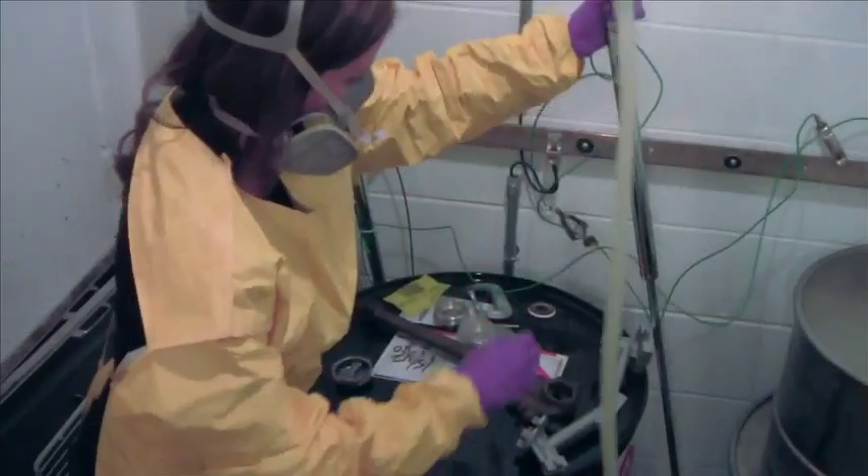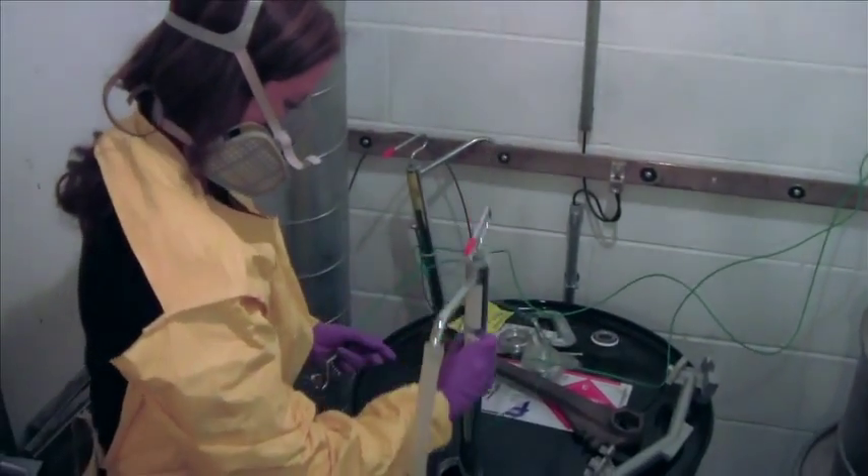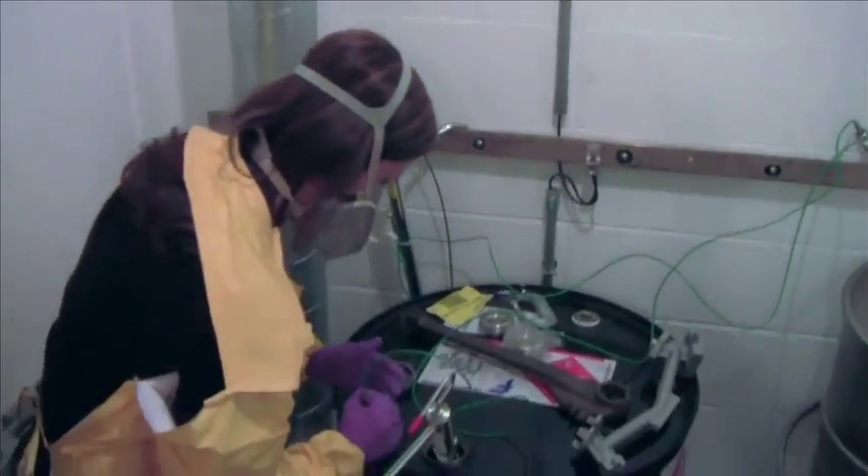What we have changed a little bit is a couple of the techniques, and we've been able to get a few extra pieces of equipment. So now we can go back and increase what we're looking at — where we were once only able to visualize something from say the forearm down, we actually have the space now to prepare things to look at the entire arm all the way up.